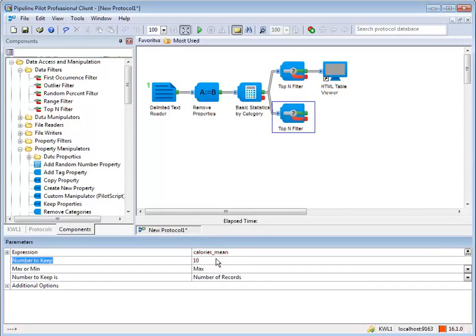When dragging a component into a pipeline, existing pipes are highlighted to indicate how the new component will impact the pipeline structure.